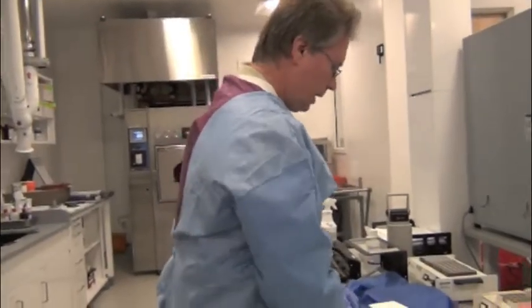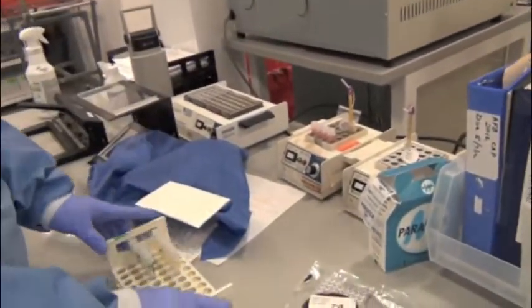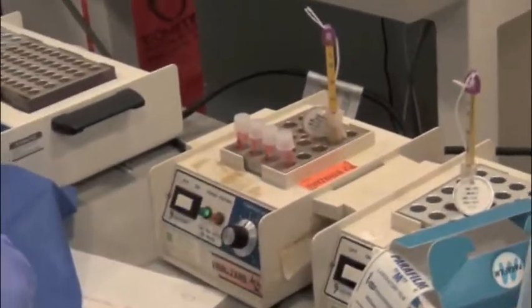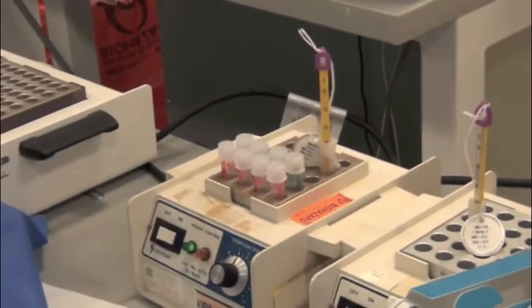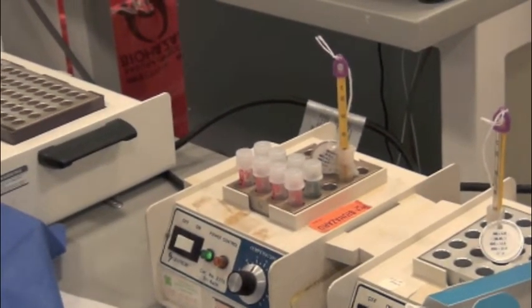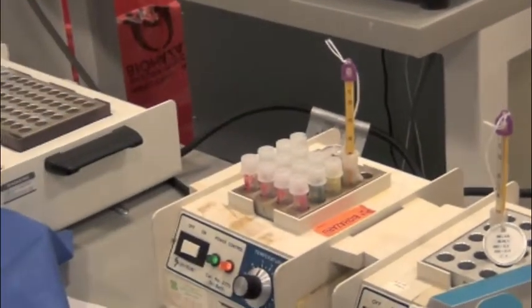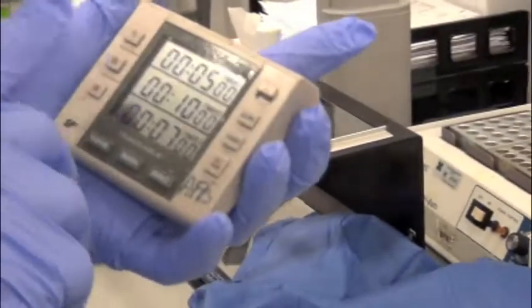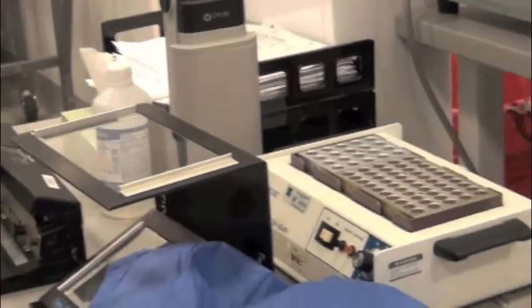Now we're going to put these back in for various amounts of time. The TB, or the red tubes, will be incubated for 10 minutes. The green ones for 7 minutes. And the yellow ones for 5 minutes. Then we'll take them out when they're done.